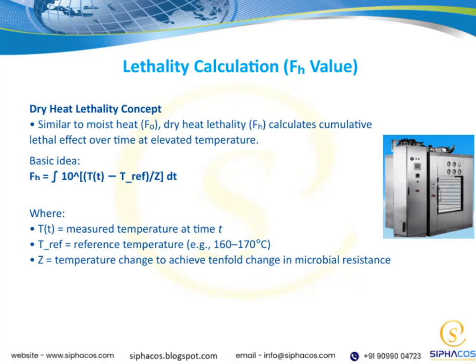Let's talk about the lethality calculation, specifically the FH value, which relates to dry heat lethality. Similar to moist heat, like what we see with F0, dry heat lethality measures the cumulative lethal effect over time at higher temperatures.